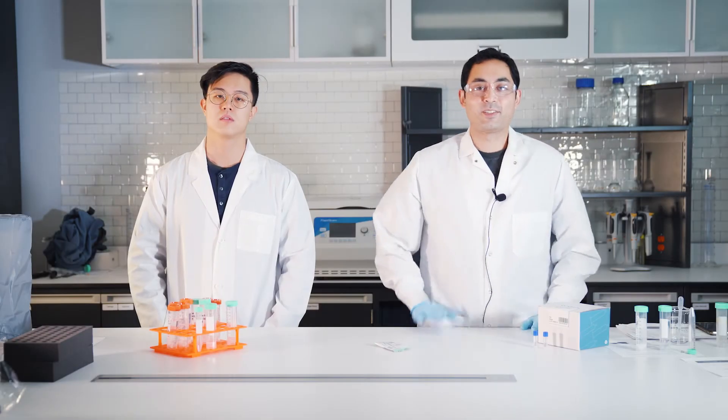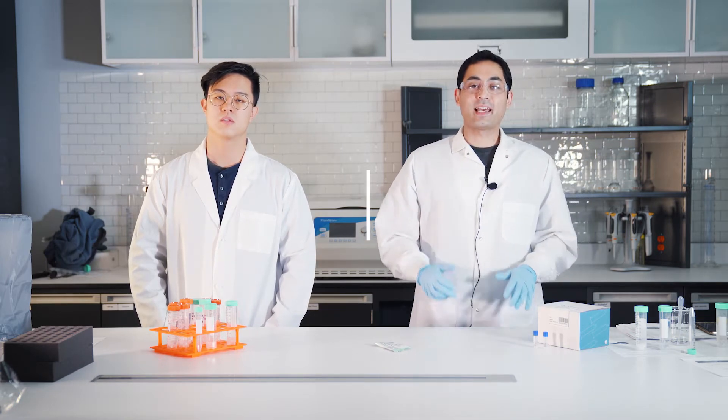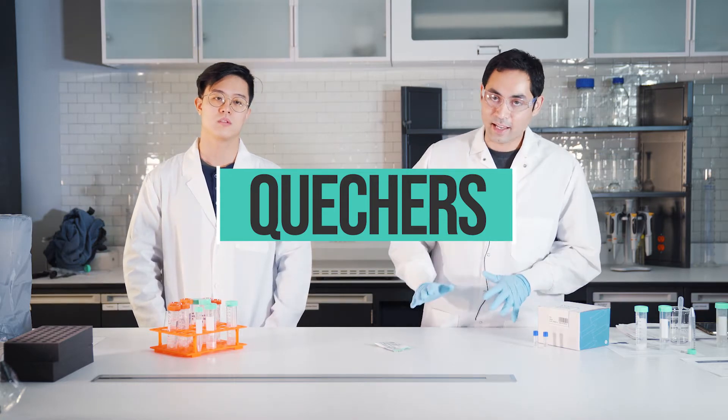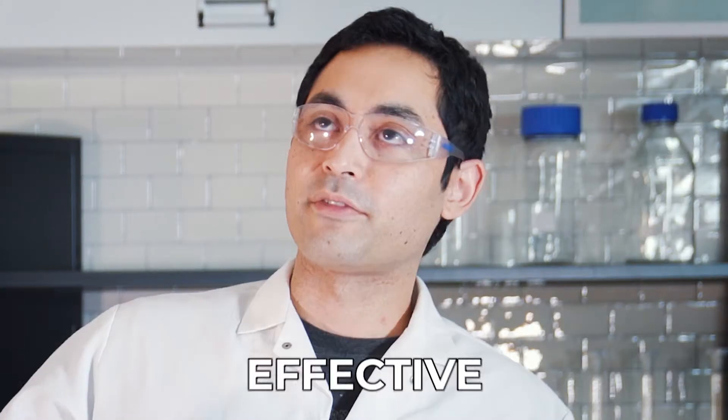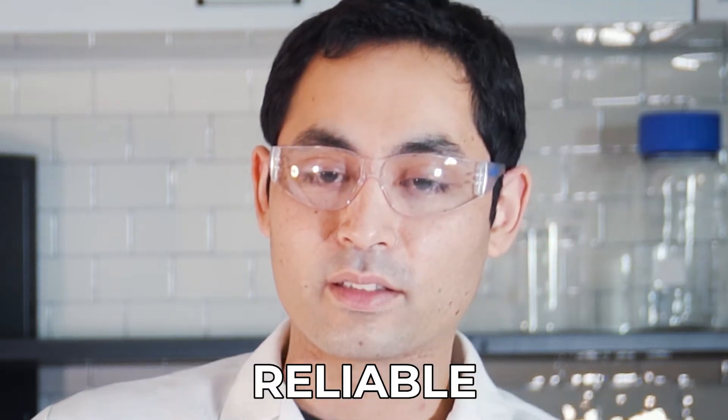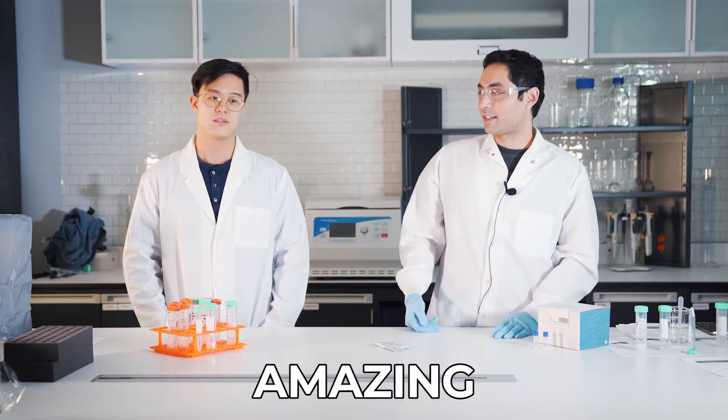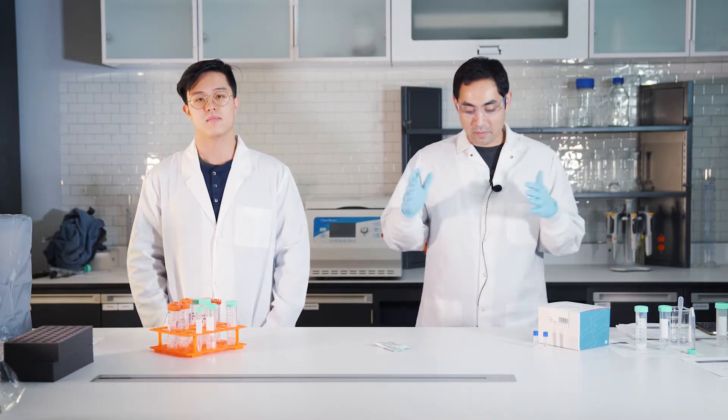Today we are going to be talking about QuEChERS. QuEChERS stands for quick, easy, cheap, effective, reliable, safe - fantastic, sure, amazing, fire, whatever, super lit if you want - but basically it's amazing.